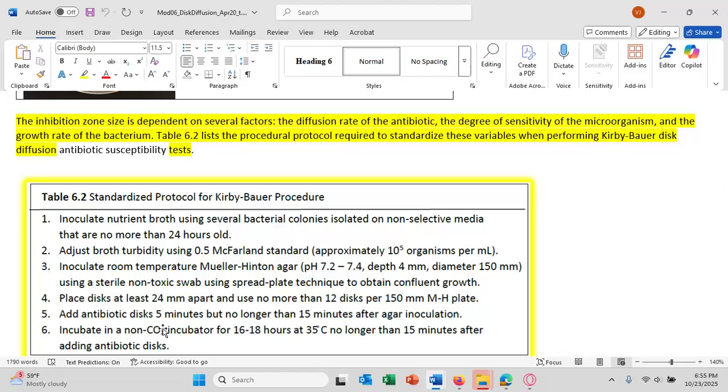That's mainly to absorb the liquid that you put on the agar and then get the bacteria just established in location. And you don't want the bacteria to grow while you put the disc on before 15 minutes are up once you put the bacteria on. Any question about that part?